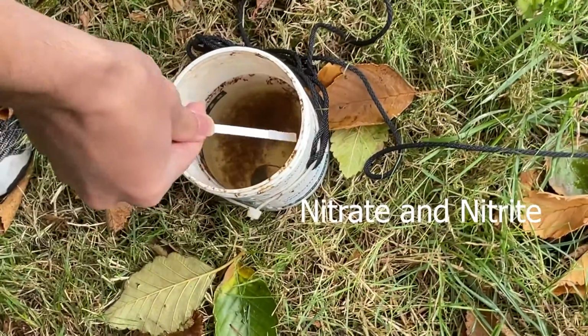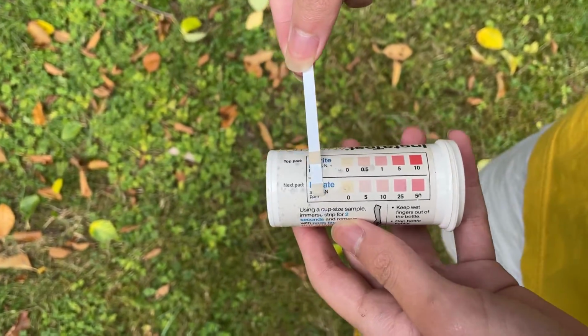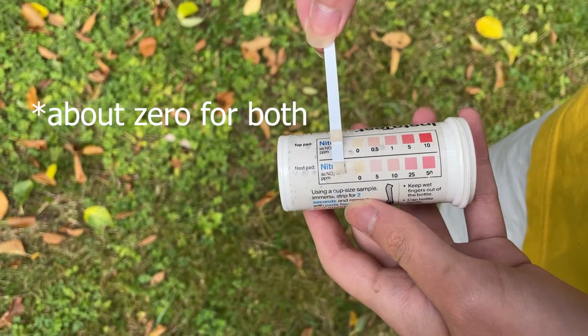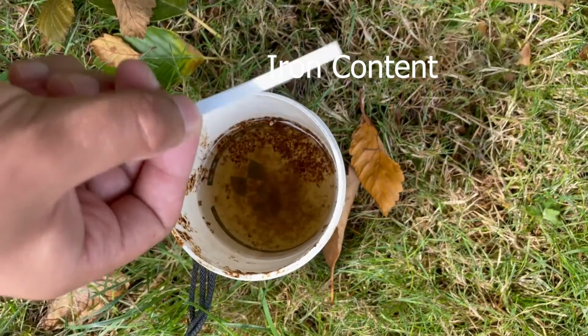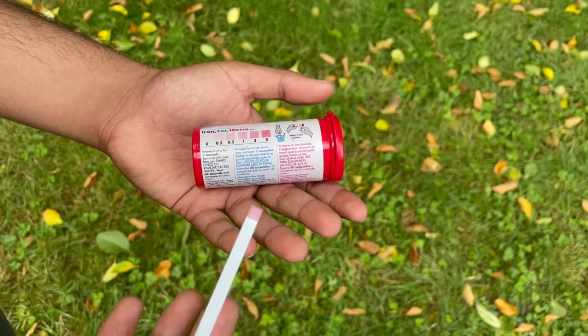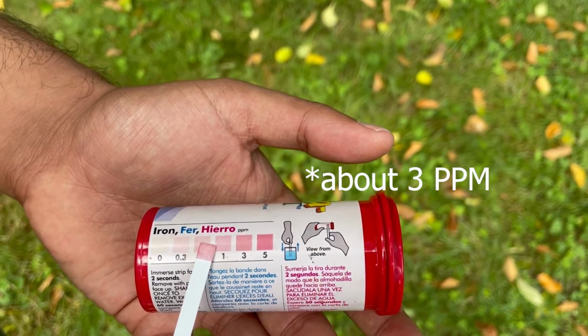Once dipped in water, compare the shade of the pads with the corresponding shade of the squares on the bottle which you got your strip from to test for both nitrite and nitrate contents. Once dipped in the water, compare the shade of the pads with the corresponding shade of the squares on the bottle which you got the strip from to test for the iron contents in the water.